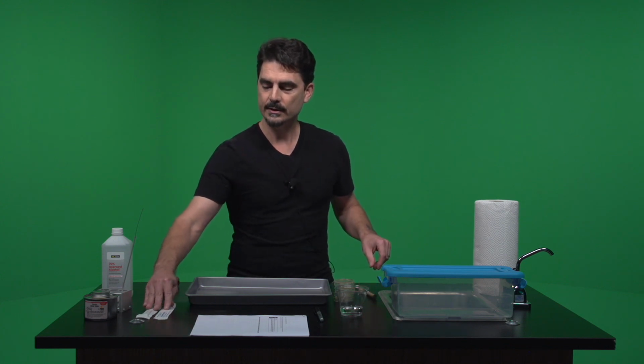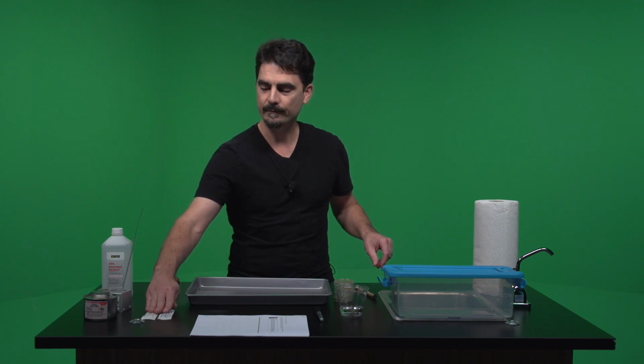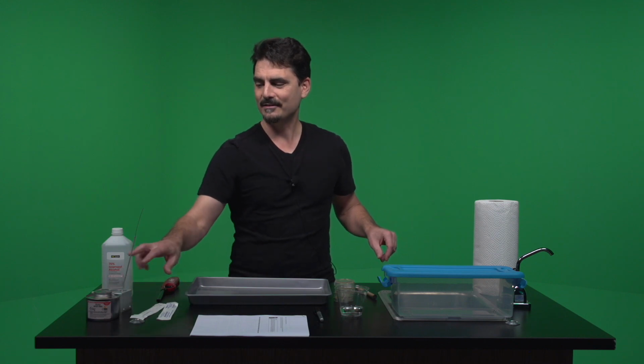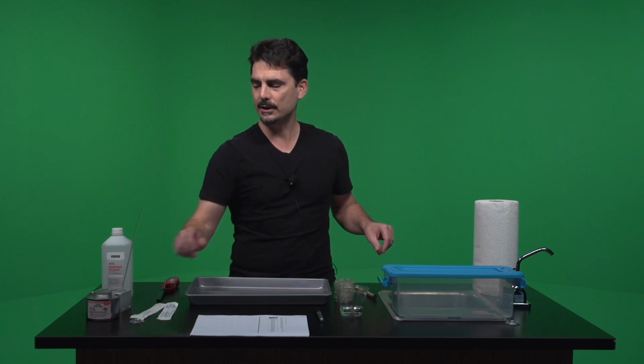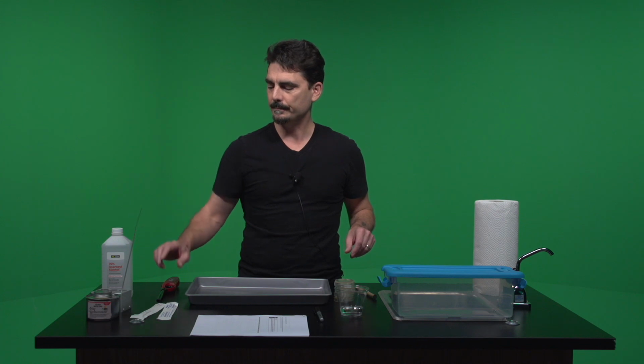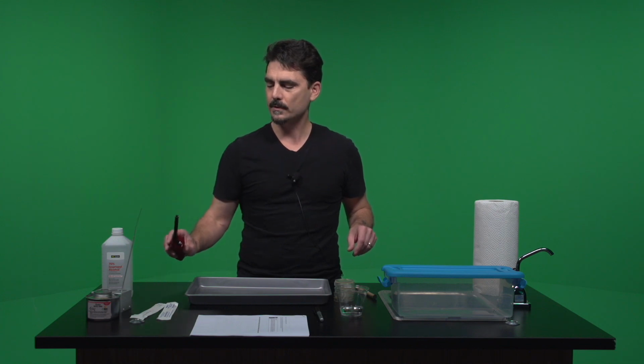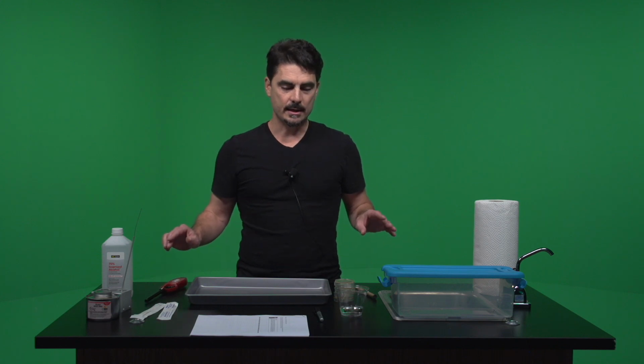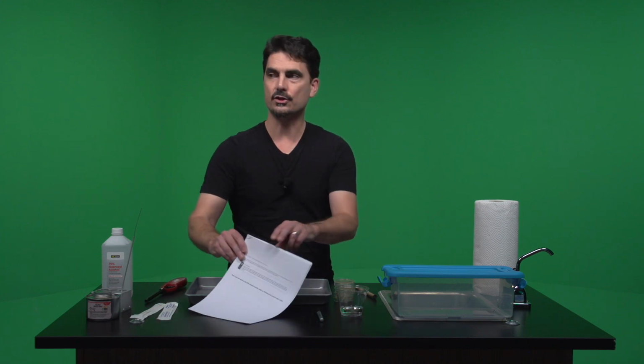I've got 2 sets of sterile swabs. Each one has 2, so that's 4 swabs. I've got my fire in a can. I've got my inoculating loop, something to hold on to it, isopropanol, and my lighter. And so the other thing is our instructions.